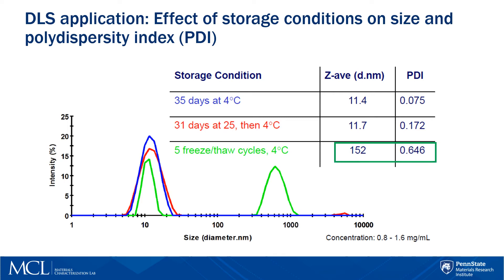The average diameter and polydispersity index were also reported. The polydispersity index estimates the width of the distribution. Samples that underwent five freeze-thaw cycles — shown as the green line on the plot — show a larger average diameter and higher PDI value, indicating wider size distribution compared to other samples. The second peak at about 700 nm suggests particle aggregation at these storage conditions.